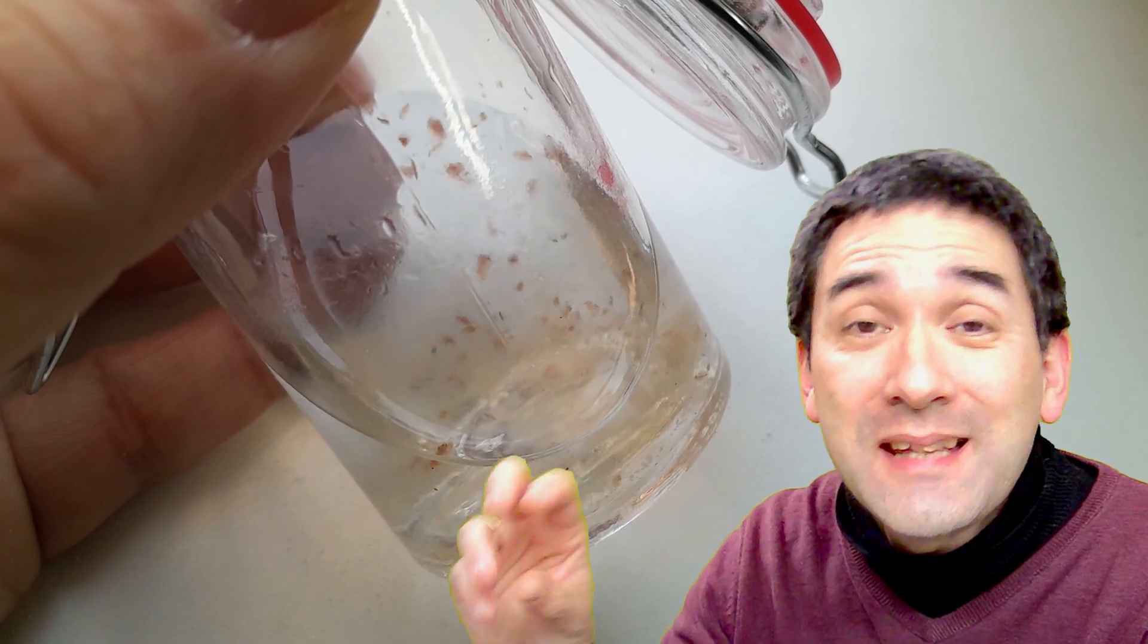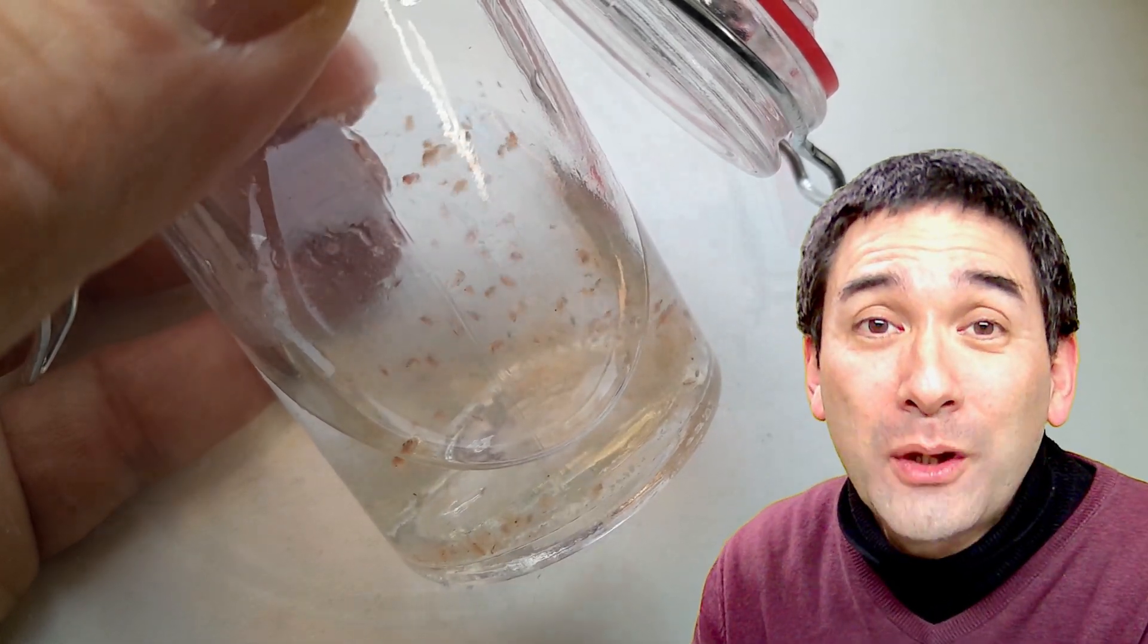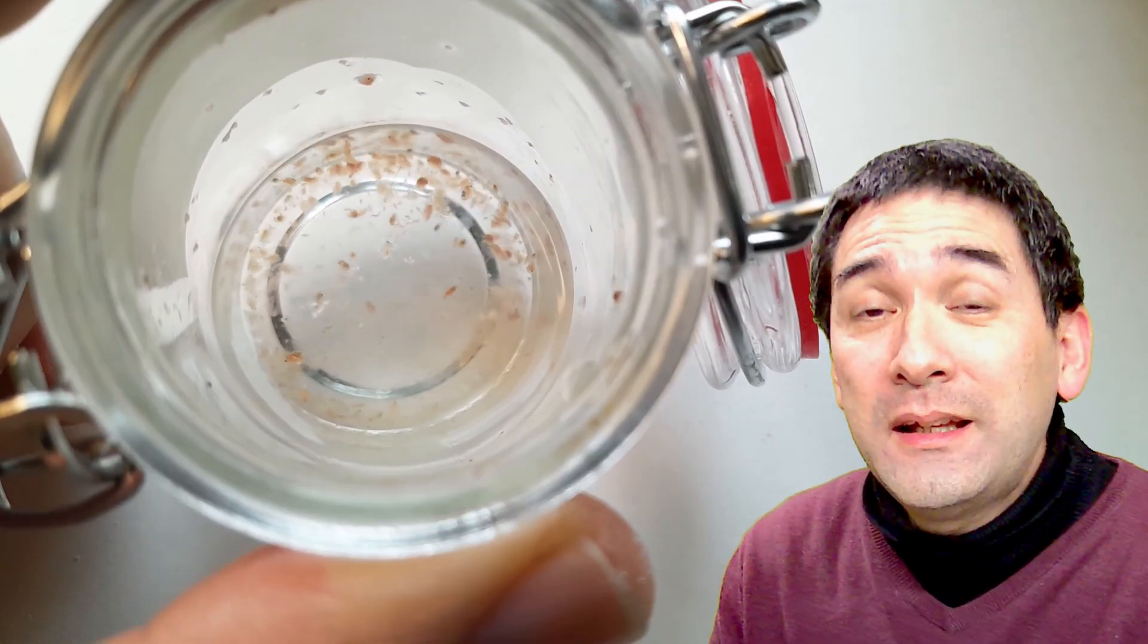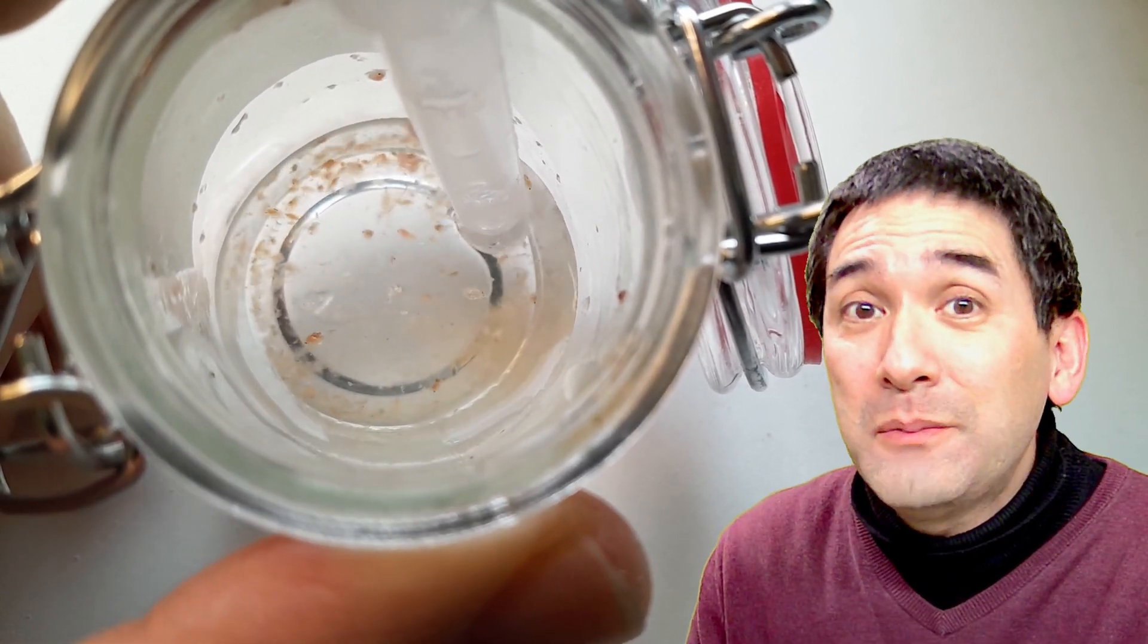I was able to see some eggs and some tiny little water fleas in there as well, and I decided to simply put them on the microscope slide and add a little bit of alcohol to those water fleas to see how their behavior changes.